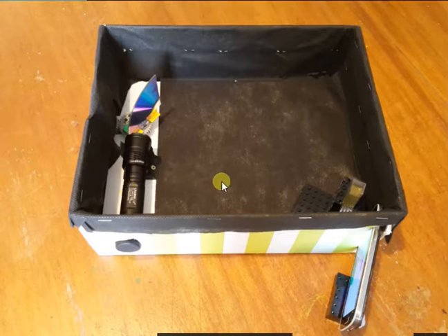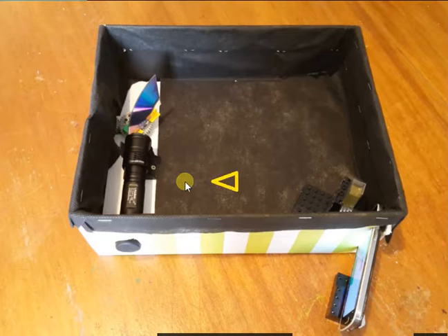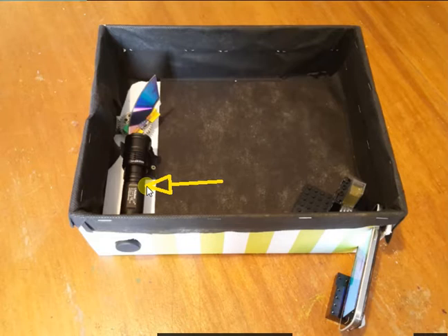The components that are important for a spectrophotometer are a light source. In the shoebox spectrophotometer I've got this LED torch. It's a really cheap one but it's quite bright.